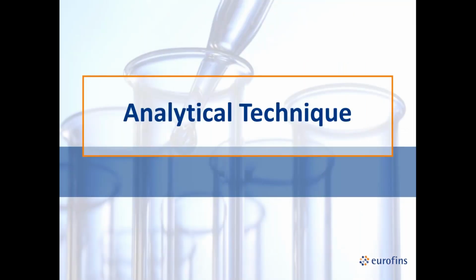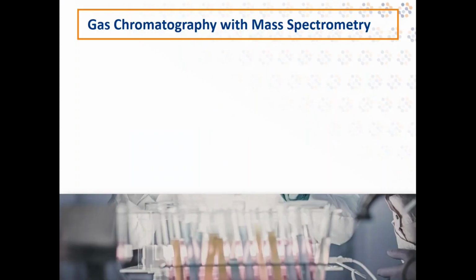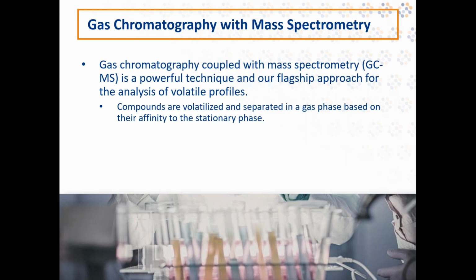And so it's all well and good to talk about looking at volatile profiles, but how do we actually determine those for a product? And we use a technique known as gas chromatography coupled with mass spectrometry, or GCMS for short. And GCMS is a powerful technique and our flagship approach for the analysis of volatile profiles. In this approach, compounds are volatilized and separated in a gas phase based on their affinity to a stationary phase. And we can tailor this approach to different classes of compounds by changing our stationary phase and our temperature gradient that is used during separation.